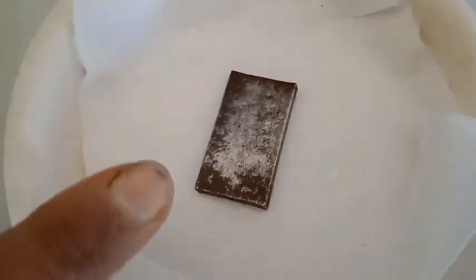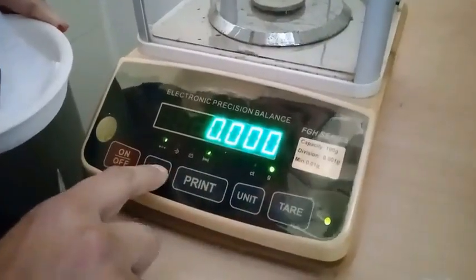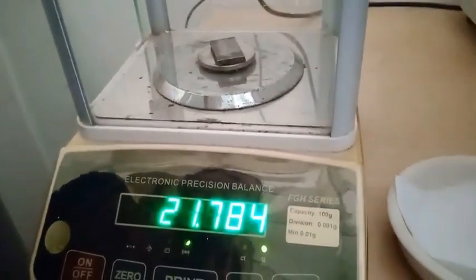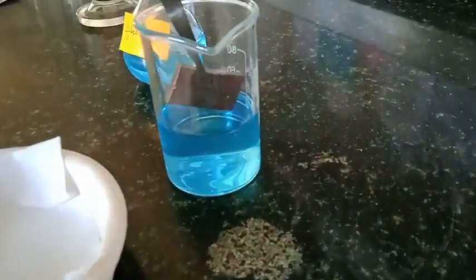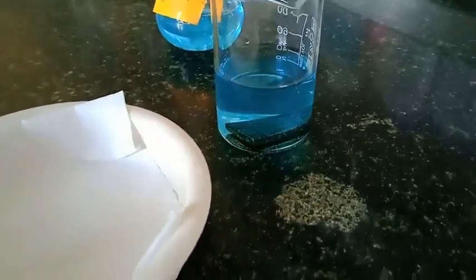So here are the rusted iron strips and this is the clean iron strip. Now I'm going to first weigh this iron strip. So make it 0 first. And now weigh this iron strip before dipping it into the copper sulfate solution. So this is 21.784 grams before putting it in the copper sulfate solution. Now I put it in the copper sulfate solution which I have prepared.